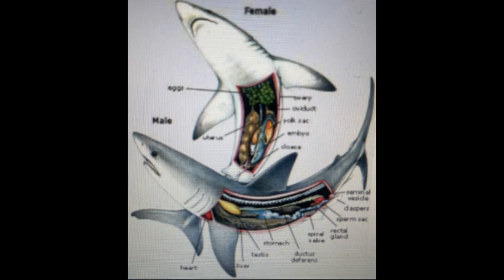Today, Hayden and Xuan will introduce various systems of the shark for you. In general, we will talk about the digestive system, circulatory system, urinary system, and reproductive system. Each system has its typical anatomic structures and functions. While some of them might share certain parts with others, only if all systems work together and help each other will an organism live a good life.